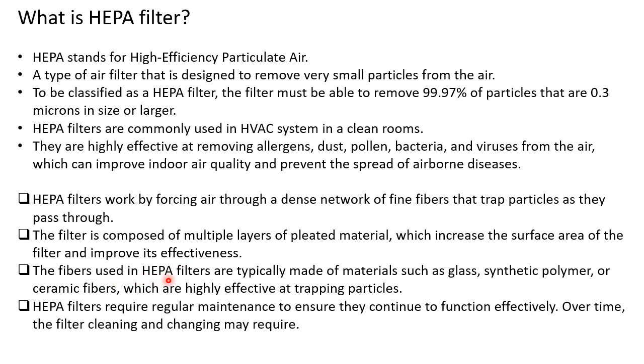The fibers used in HEPA filters are typically made of materials such as glass, synthetic polymers, or ceramic fibers, so they are highly effective in trapping particles. Now HEPA filters require regular maintenance to ensure they continue to function effectively. And yes, it is also a filter, so over time, cleaning of this type of filter, and you can say changing, may also be required.